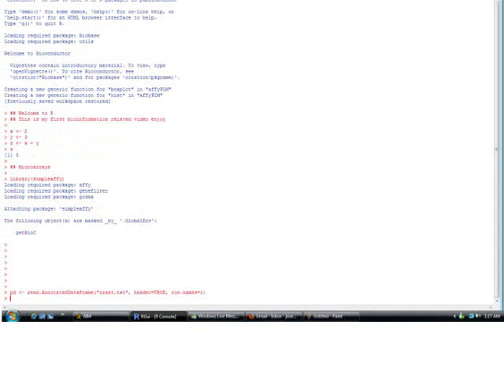So we're going to pull in our what's called a covdesc file. We're going to pull in the data from that and I'm going to show you the proper way to set up a covdesc file. I usually just call it treat.text. It's a tab delimited file.